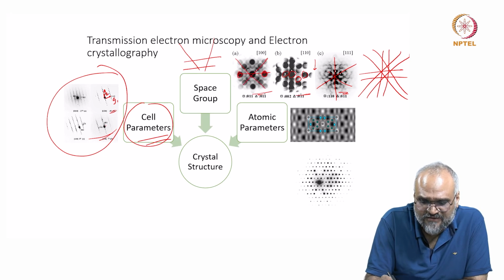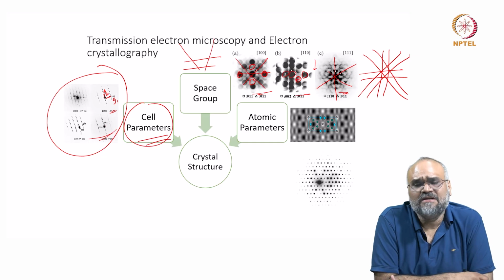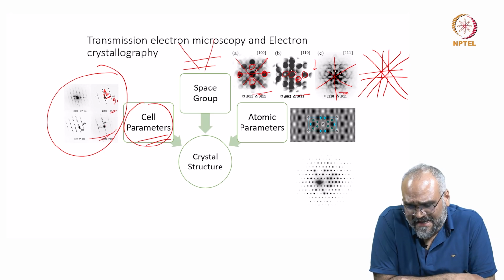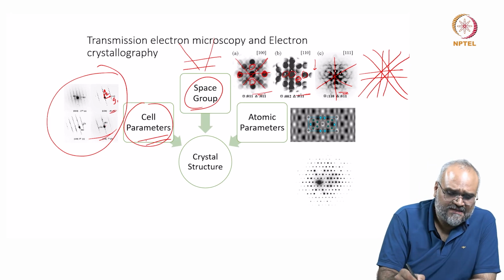If there are some defects, can I highlight these defects, what kind of image or information I have within these disks as well, and it is actually a very powerful tool with which I can get excellent symmetry information from a specimen.